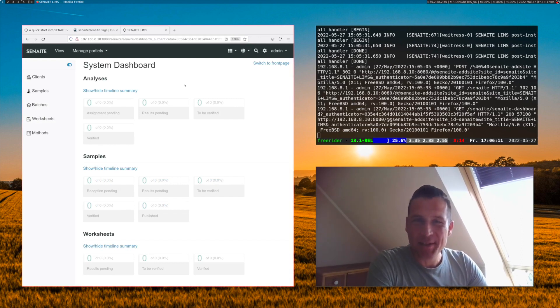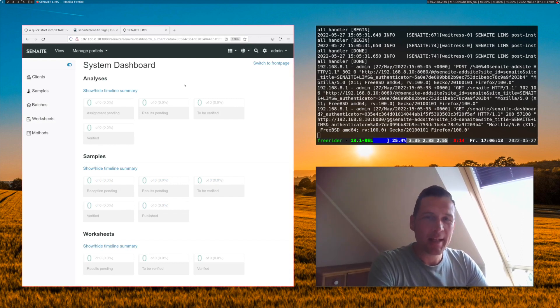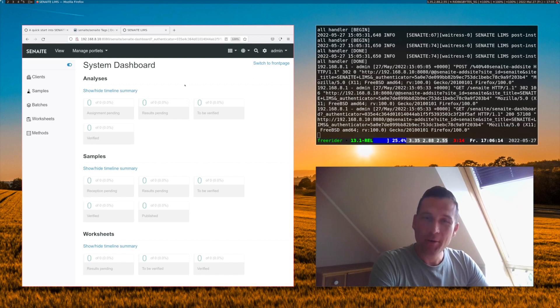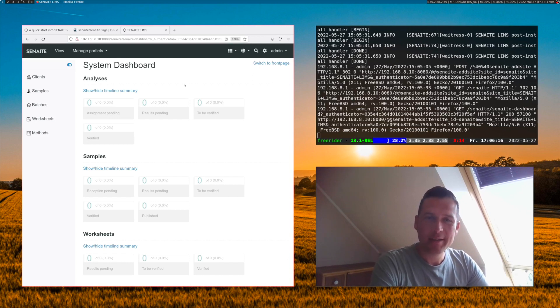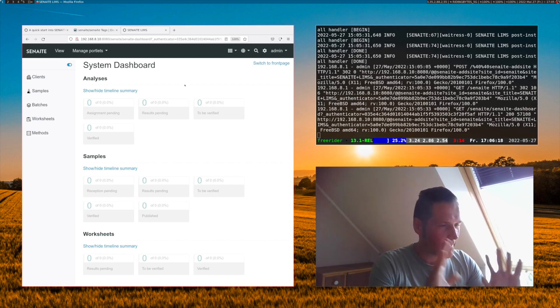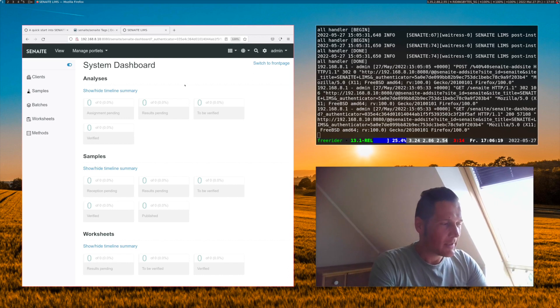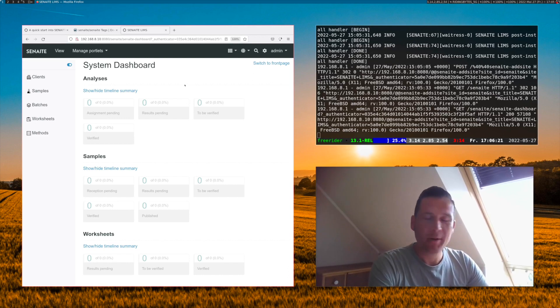So congratulations, you successfully installed Senn8 on your local computer inside a container without all of the issues of installing Senn8 manually.